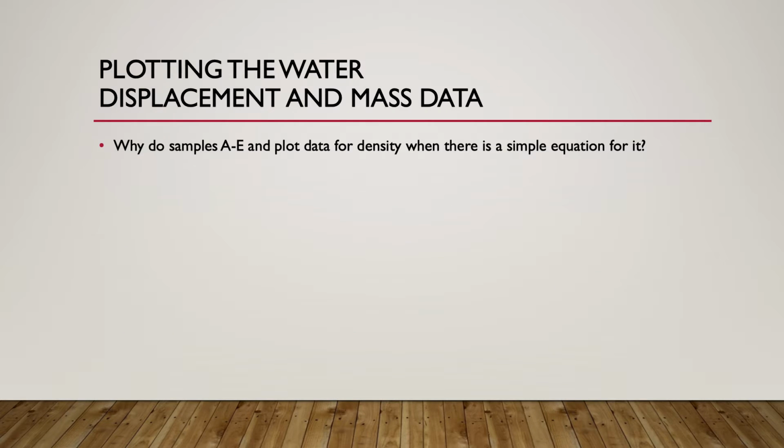So for that plot, at the end of the actual experiment, and this part about plotting things is going to be done outside of lab. It doesn't have to be done before you leave. But if you have a laptop with you and you want to plug these things into Excel quick, it only takes a few seconds to see if you can get a plot that makes sense.